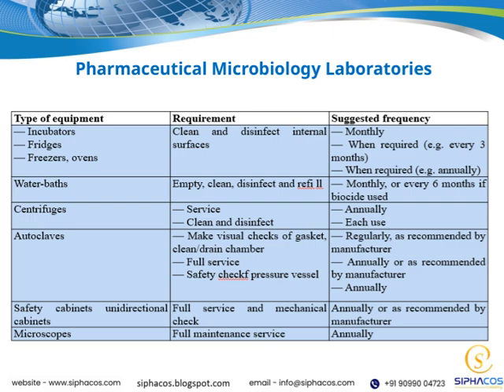These labs are equipped with advanced technologies and follow rigorous protocols to identify bacteria, fungi, and other microorganisms that could compromise product quality. Connecting this to our overall theme, these labs serve as the frontline defense in protecting public health. They help us ensure that every batch of medication meets the highest safety standards before it reaches patients. This way, we can prevent potential contamination issues and uphold the integrity of pharmaceutical products.